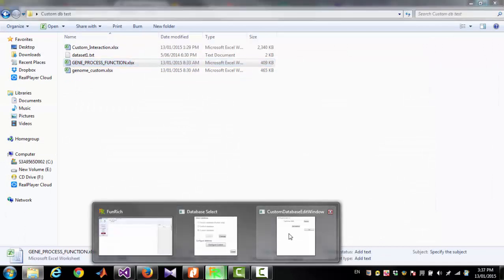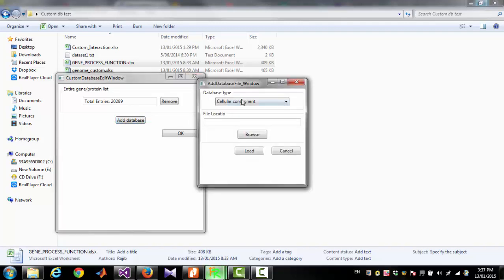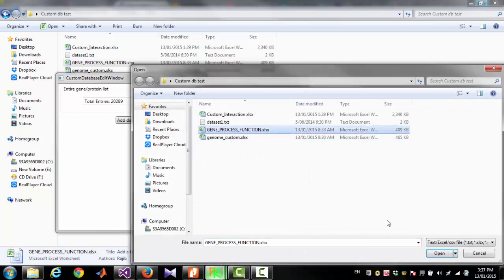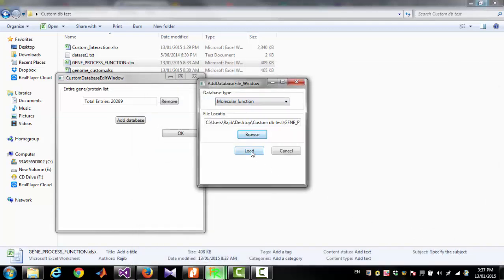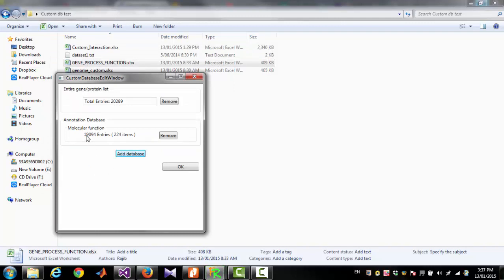Now I am going to upload that file. To do that, I am clicking 'Add Database,' then selecting 'Molecular Function,' then selecting the file, then clicking 'Load.' This will give an option to select the column for gene or protein — in this case, column one is our gene. Then you have to select which column contains molecular function. For this example, column two is our molecular function. So I am selecting column two and clicking 'Read and Apply.' Now we have almost 19,000 entries in that file and a total of 224 molecular functions.